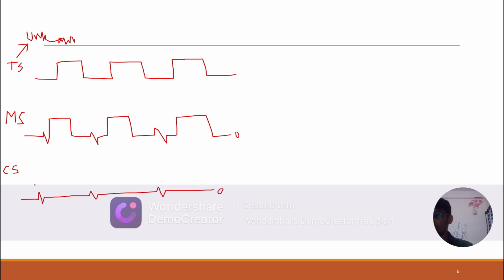But in general both of them are not centered at 0. If you are not applying a high pass filter before regression, then they are not centered at 0. And what you need to do is apply some scaling to this control signal. The control signal is isosbestic, FI, and the measured signal is excitation, what we call FE.